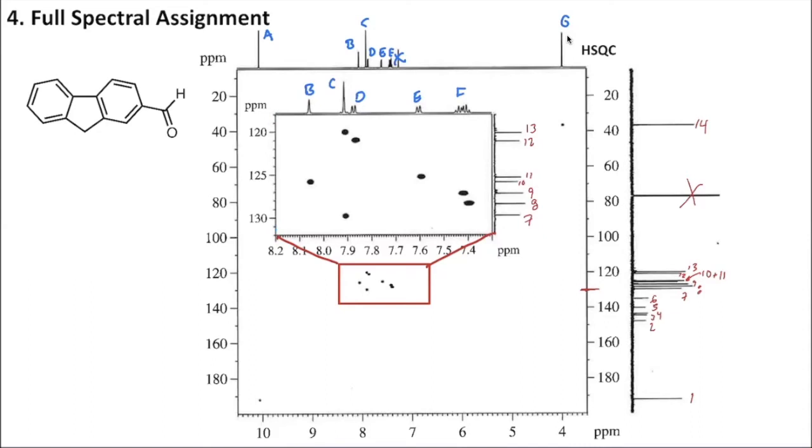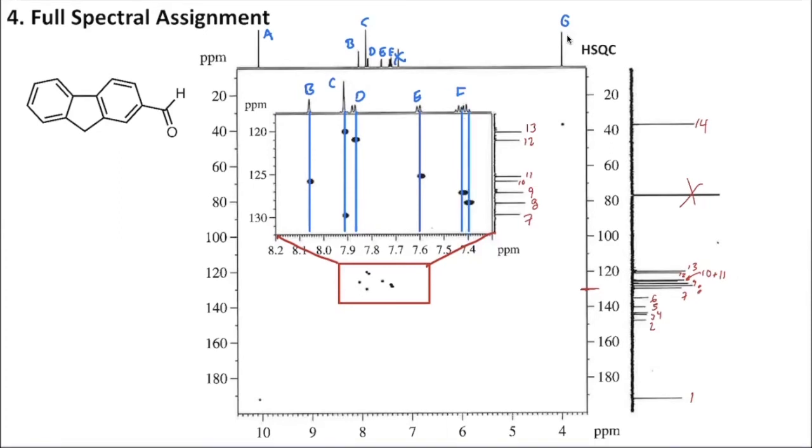So again, I'm going to practice drawing my lines straight down from the top and just moving them over so that they can correspond to whichever proton they go with. And again, trying to work as carefully with these as possible so that we make sure we're getting our correlations right. Luckily, we have the zoom for this one where we didn't for the COSY, so it may be a little bit easier to decide what's happening. Okay, so there's our hydrogens. And we'll do the same in red for the carbons. Get a nice straight line there and then move it as needed.